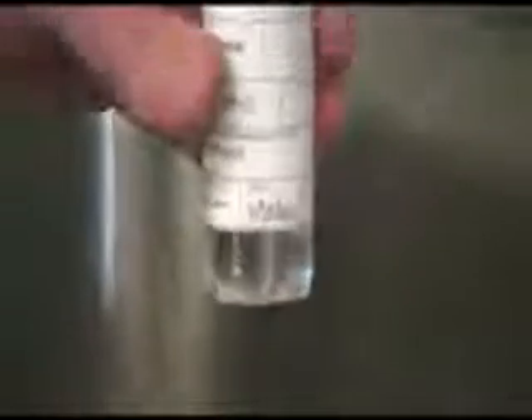Re-close cap and check for air bubbles as before. Use this same procedure for all small SOC and VOC vials. Transport to lab at 0 to 6 degrees Celsius.